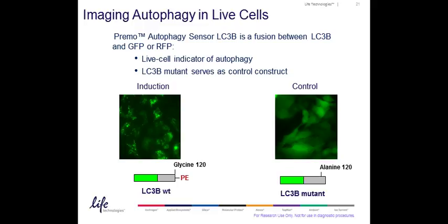It's important when doing these experiments to consider that you're often overexpressing the protein of interest, and for this reason we include a control. It's a non-cleavable version of LC3. This allows us to control for expression artifacts. Essentially, during the processing of LC3, it's cleaved at glycine 120 by ATG4, and this allows the conjugation of LC3 with phosphatidylethanolamine. If the glycine at 120 is mutated to an alanine, the cleavage cannot occur, and so LC3 cannot be recruited to autophagosomes. As I say, this serves as an important control for expression levels, as LC3B itself will tend to aggregate upon overexpression.